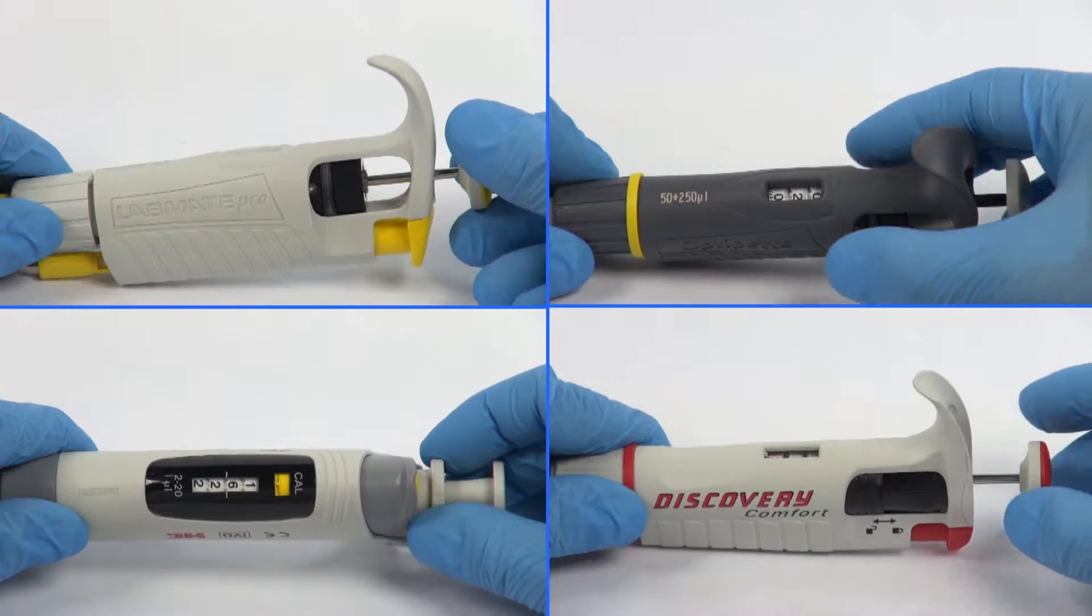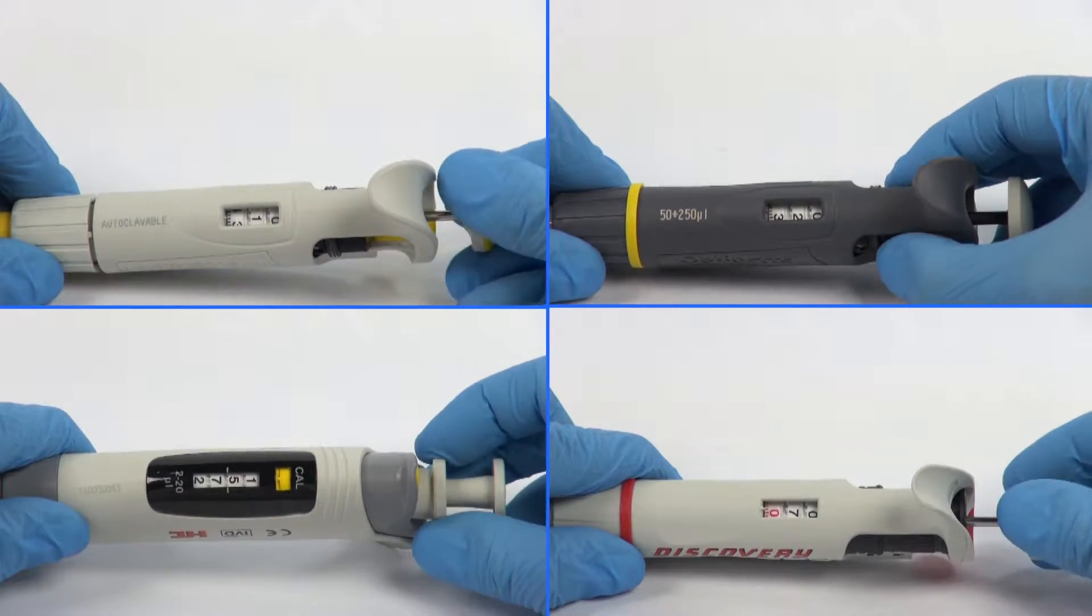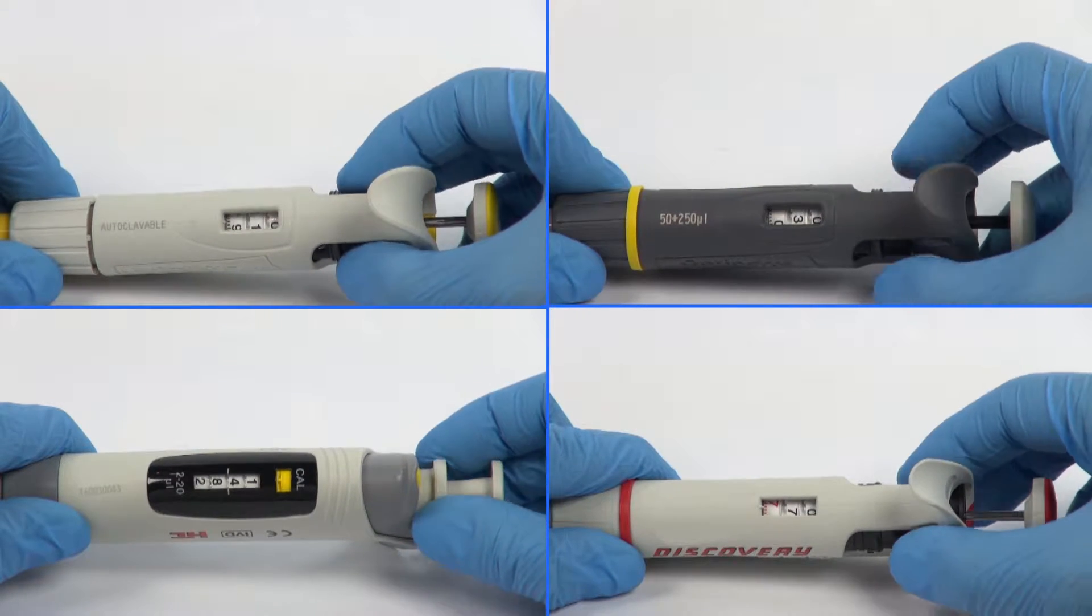Depending on the pipette model, the setting of the volume of the aspirated liquid can be done either by the pipette push-button or by the volume adjustment knob.